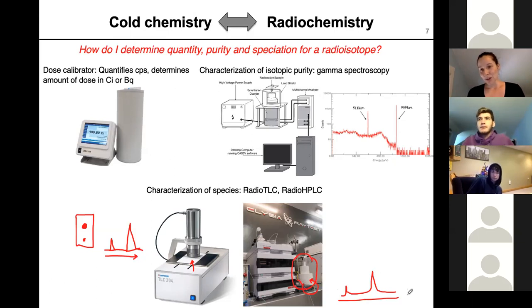So in order to take the data that we get from these radio TLC and radio HPLC machines, what do we need to know before we even set out to do the experiment?